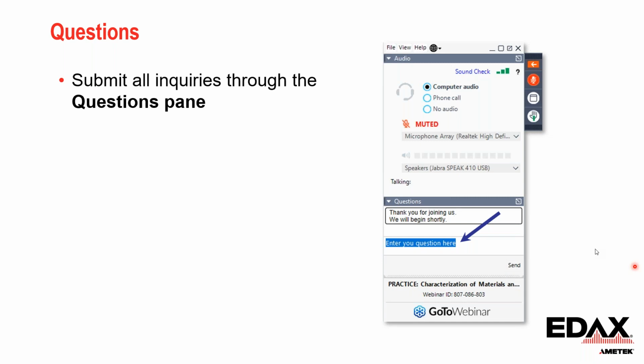That's why we recommend you to use EDS for most of your work. And when EDS hits the limits, like when you have peak overlaps in the EDS spectrum, or you want to achieve higher peak to background ratio, then you switch to WDS.